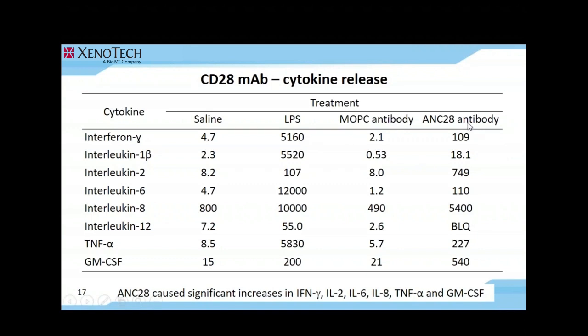The anti-CD28 antibody increased, as compared to the saline control, interferon gamma, interleukin 1, interleukin 2, interleukin 6, interleukin 8, TNF alpha, and granulocyte-macrophage colony stimulating factor, which we recognize as all major pro-inflammatory cytokines. Therefore, we proceeded with evaluating this plurality of cytokines for their effect on CYP enzymes in co-cultures.